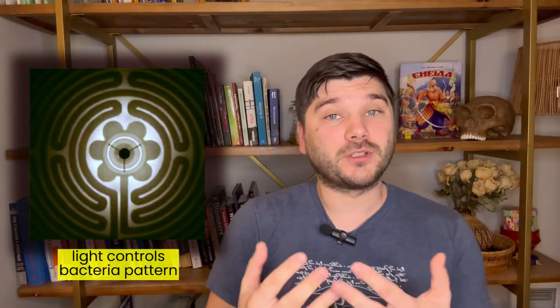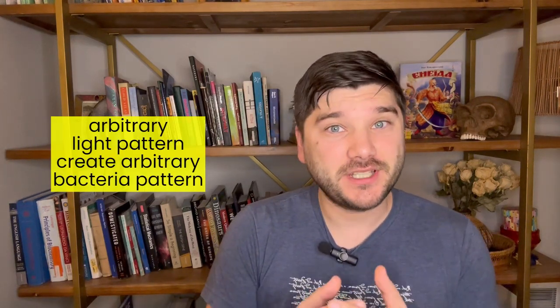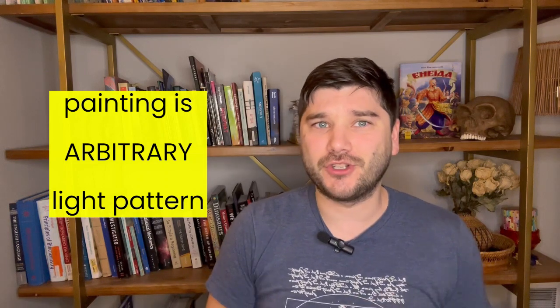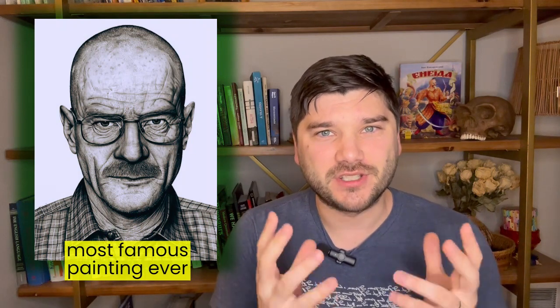So, if we control the shape of the light source, we can control the pattern in which cyanobacteria will be assembled. So, it means that if we choose an arbitrary pattern of light, cyanobacteria can be assembled in a similar arbitrary pattern. Arbitrary pattern sounds like a definition of painting to me. So, why don't we create the most famous painting ever using cyanobacteria?